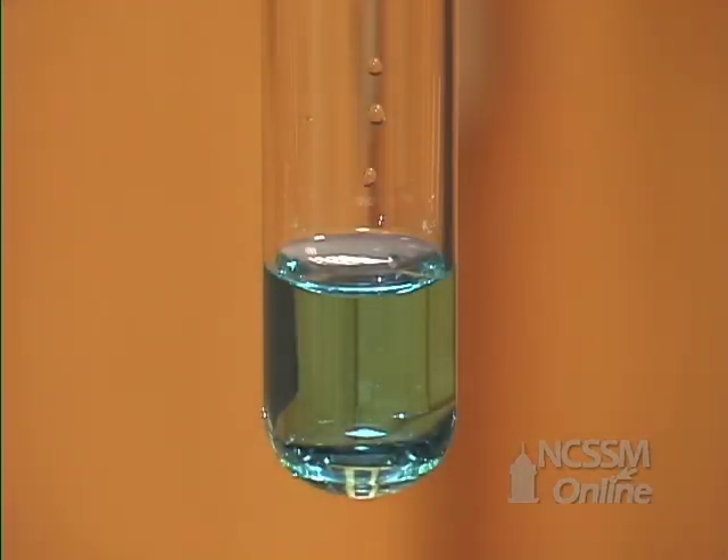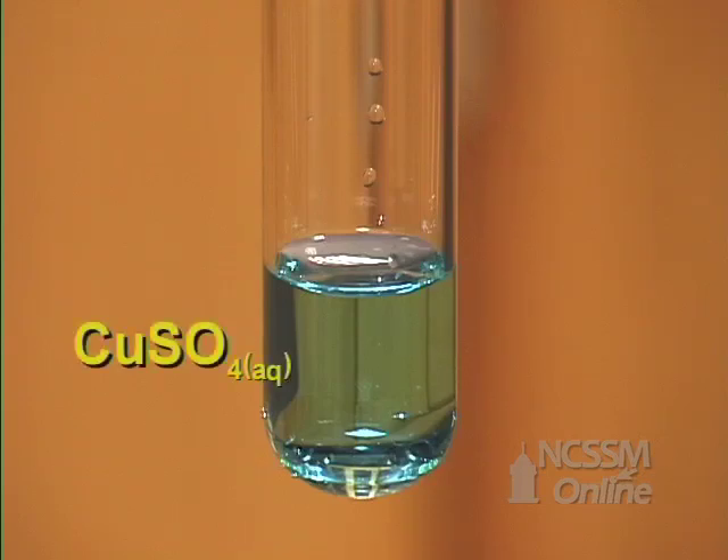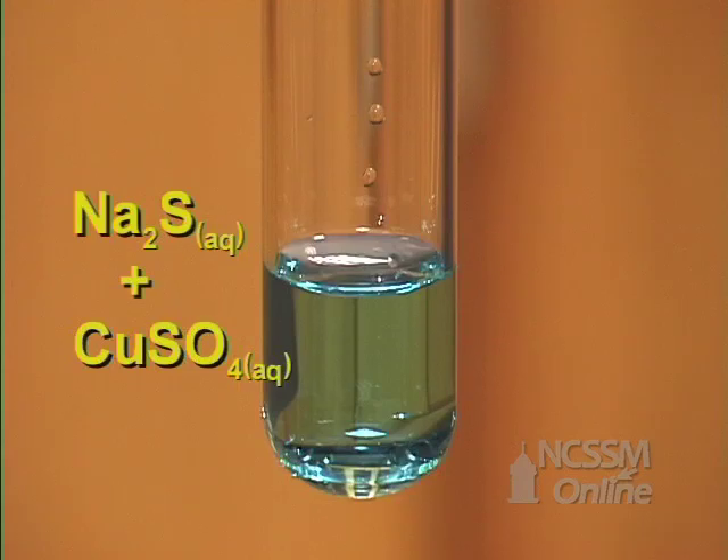In the double displacement reaction of copper sulfate and sodium sulfide, we start out with a light blue solution of copper sulfate. We'll add a colorless solution of sodium sulfide.